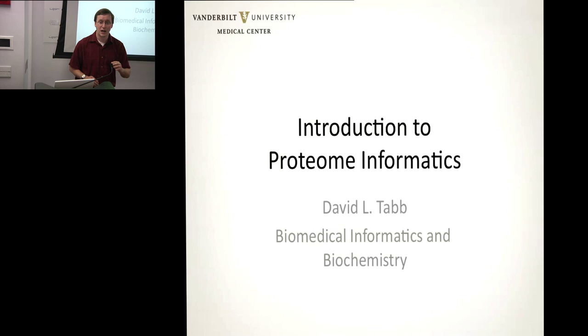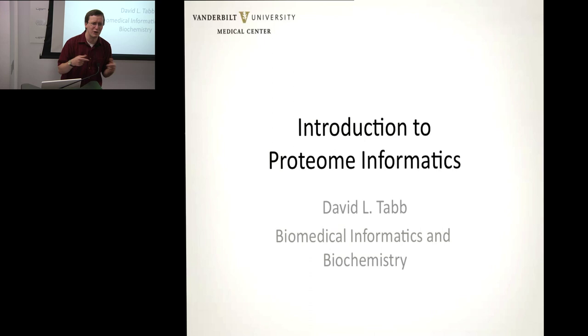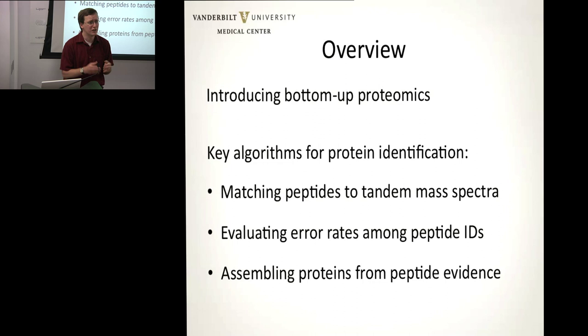I'm also part of the Department of Biochemistry. That's a secondary appointment. But it reflects the kind of dual role that I've played throughout my career, being the computer scientist that the biochemists could talk to, and also being the biochemist that the computer scientists could talk to, to figure out what each of these other groups mean to each other. There's very frequently a communication impasse between the two. And in part, that's what I'm hoping to address through this talk today, to help introduce what's going on in that black box. When you pass your mass spectrometry data to it, how are you getting information back? What's the manipulation of those data that provides information from the data?